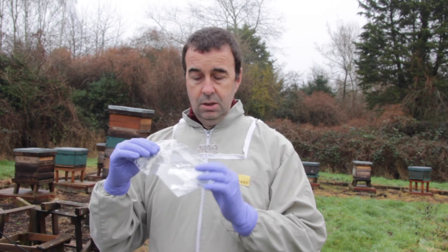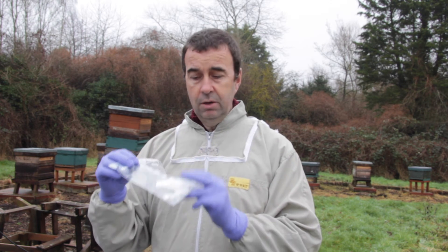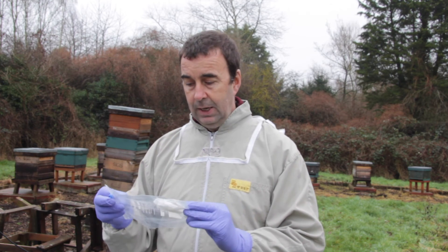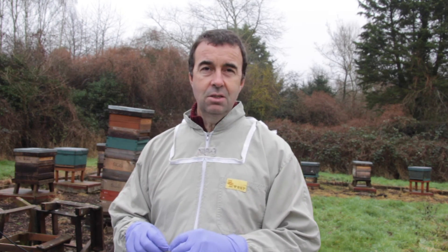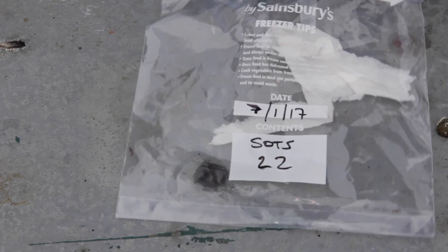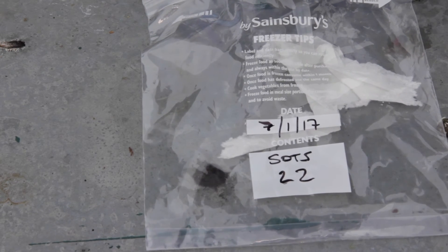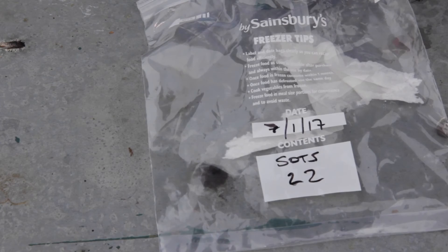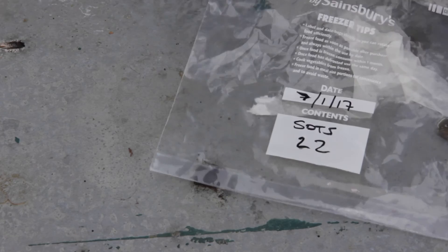On the bag we've put the date, the apiary identifier, and then when we open up the hive we'll put the hive number on it as well, so we can keep track of which samples come from where. They'll then be ready for the acarin and nosema tests. We've got our bag and we're just going to put about three or four mils of ethyl acetate into the bag onto the tissue and allow that to soak in, then zip it up.